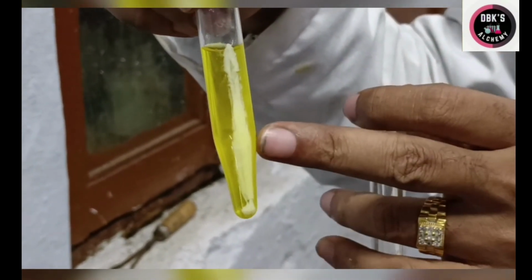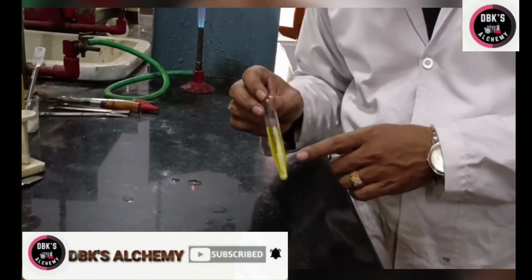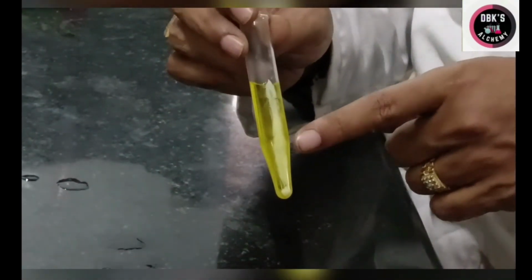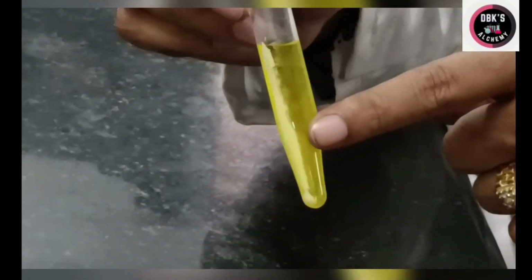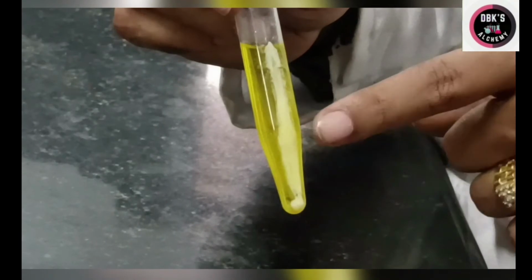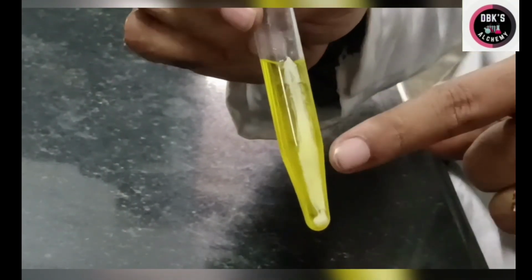So this white color precipitate is indicating the presence of calcium plus 2. As I told you, this contains a white precipitate of calcium oxalate. Actually, we were thinking that it's a yellow color precipitate, but once we centrifuge, we came to know that it is a white precipitate of calcium oxalate. So it is confirming the presence of calcium plus 2.